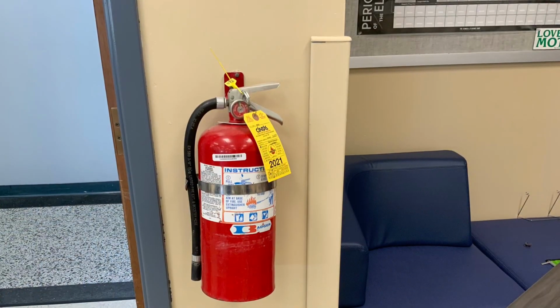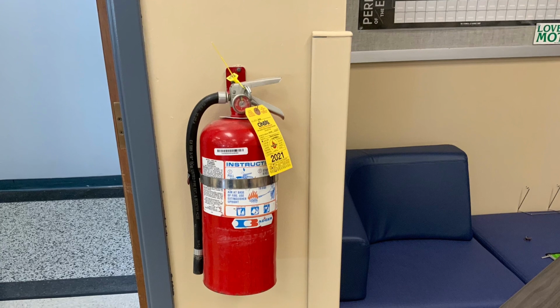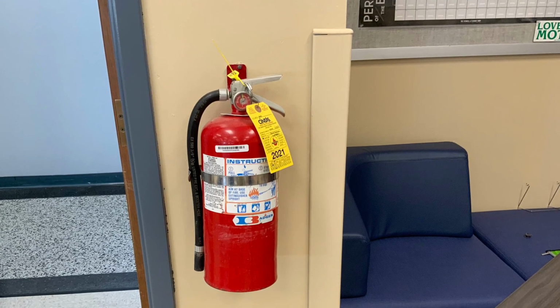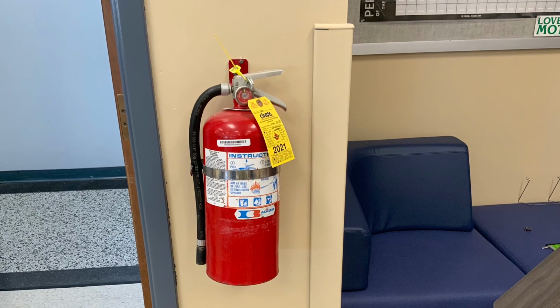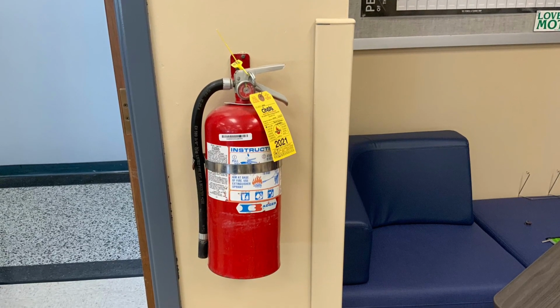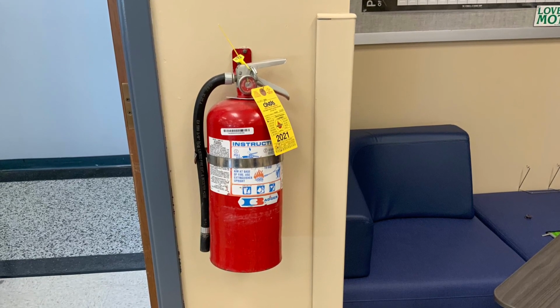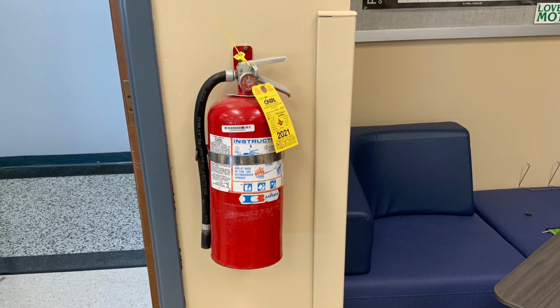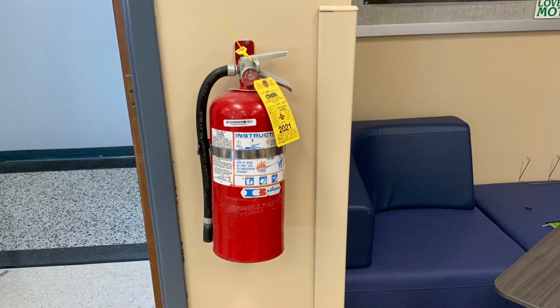This is obviously a fire extinguisher. This is more for when something catches on fire and a fire needs to be put out, not necessarily someone. That's more for the chemical safety shower. But the fire extinguisher is to be used when a part of the lab or the whole lab, and I hope not, catches on fire. That's going to be used to put out the fire.